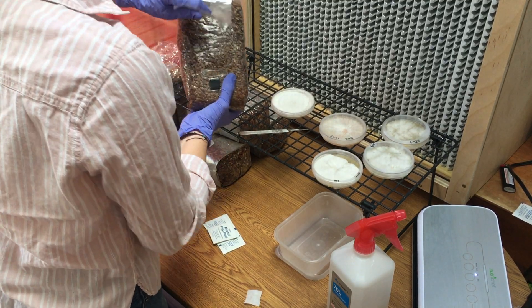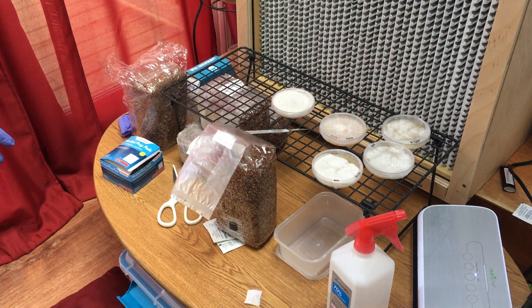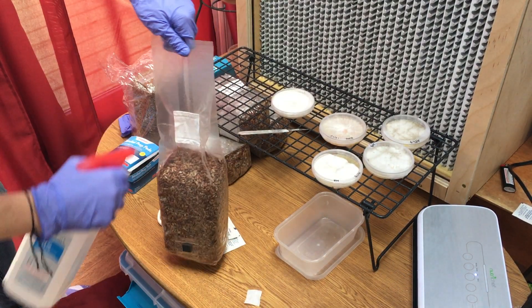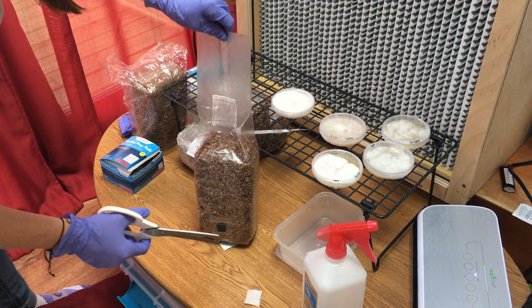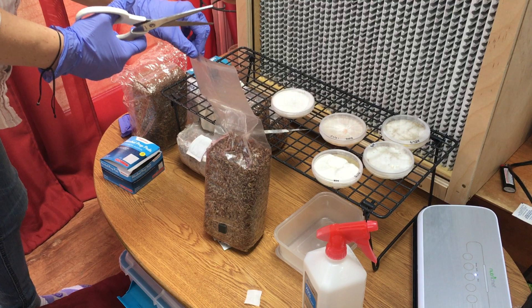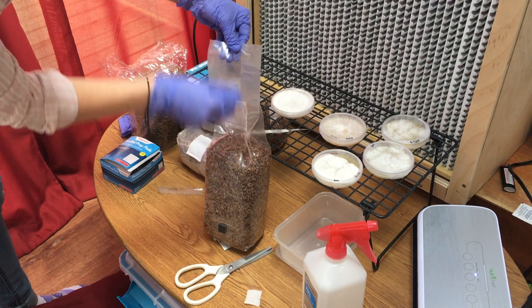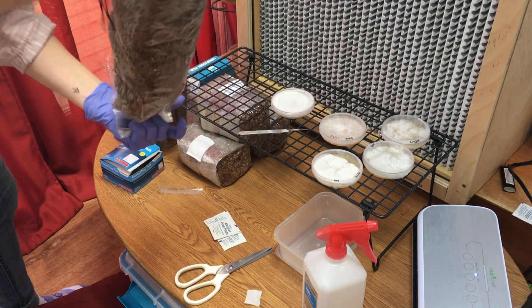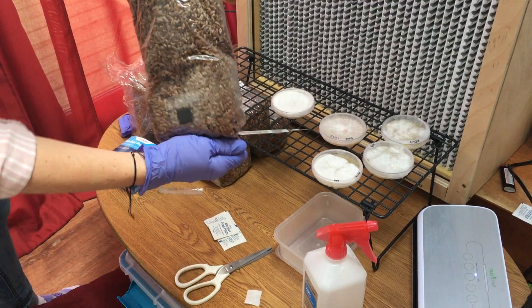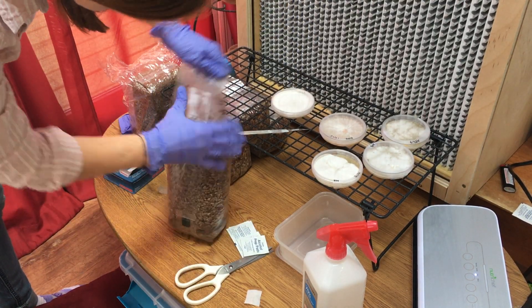I am using a pre-sterilized spawn bag that I got from Spawn Magic. These bags are great quality and super inexpensive. When you first get these bags, they are tightly sealed and hard to mix. An easy way to mix them is to carefully cut open the top and let a little fresh air in. Then fold over the top and carefully mix the grain.